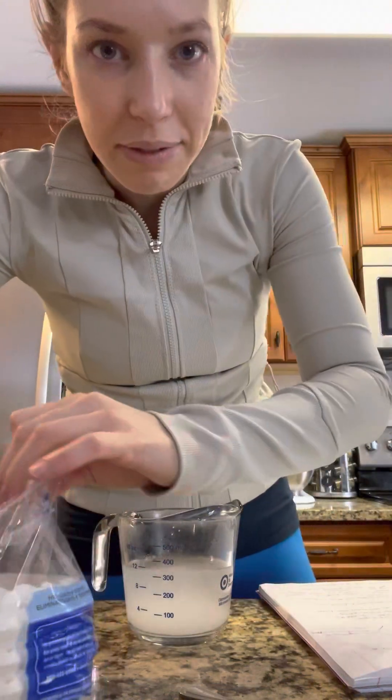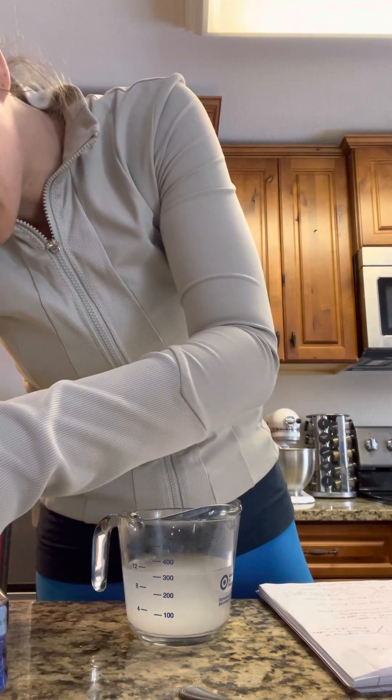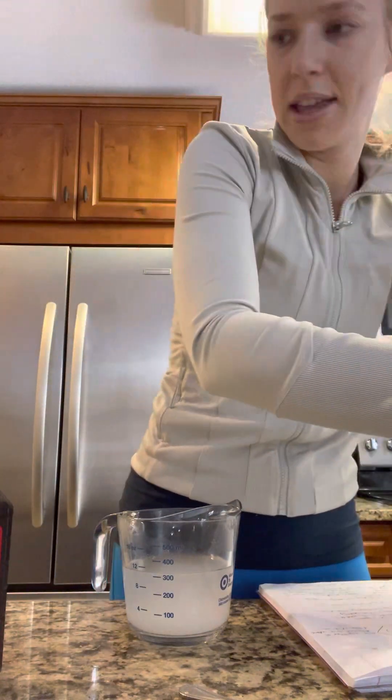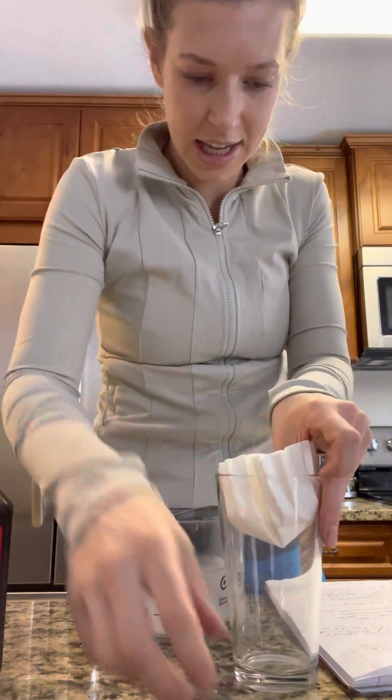I'm going to get a coffee filter — I have one minute. Of course my fingernails are short. So we're going to get a few, shove them into this cup, and try to pour this solution in here.